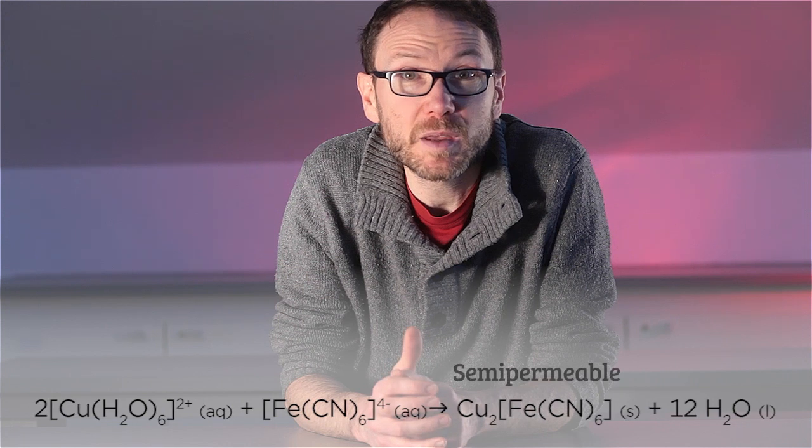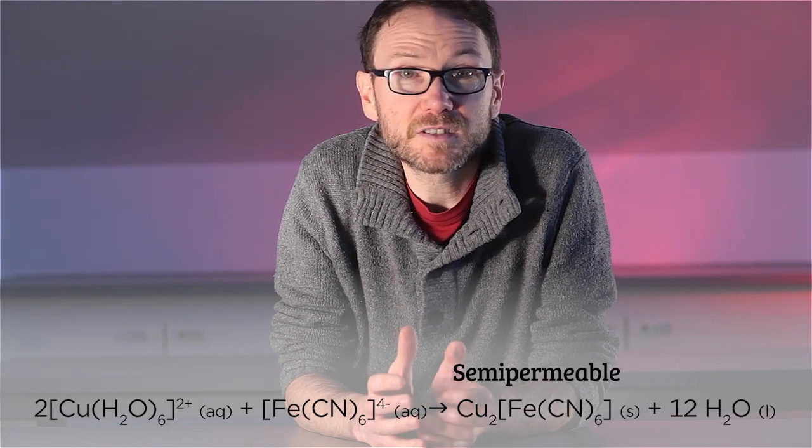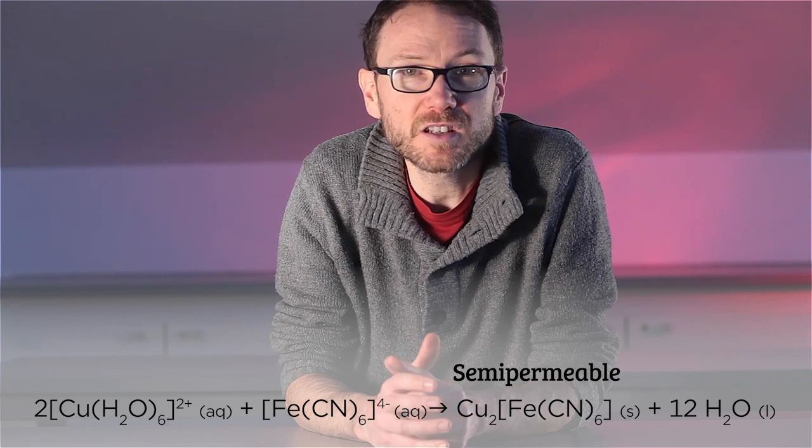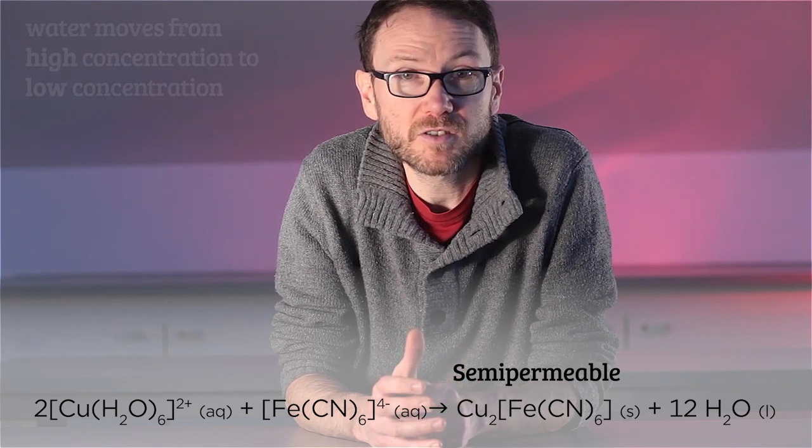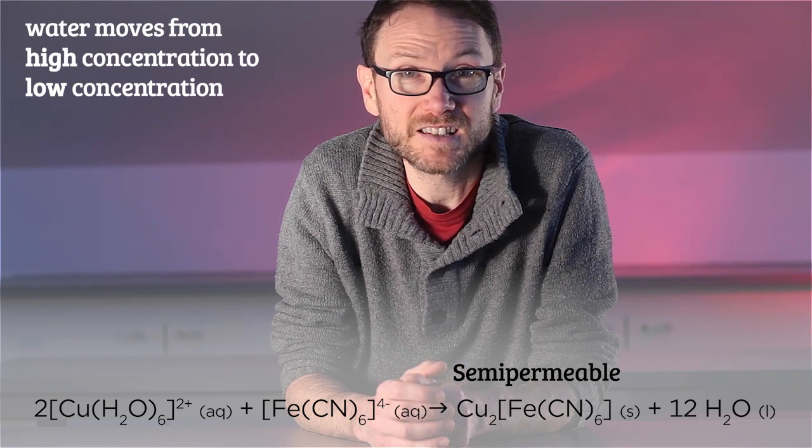It turns out that when copper sulfate reacts with potassium hexacyanoferrate 2, a colloidal suspension is formed which models a semi-permeable membrane pretty effectively. Water molecules are able to pass through much faster than the other species in solution and will move down the concentration gradient from areas where the water is more concentrated to where it is less concentrated.